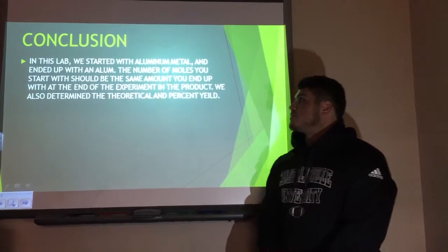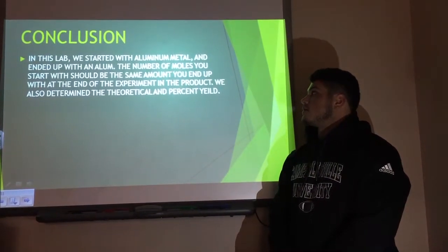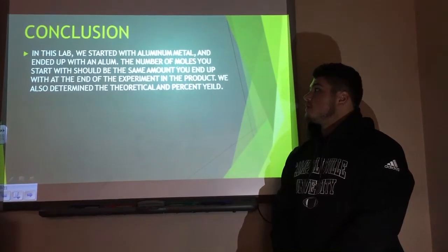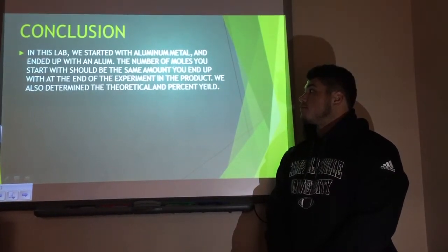In this lab, we started with aluminum metal and ended up with an alum product. The number of moles you start with should be the same amount you end up with at the end of the experiment in the product. We also determined the theoretical and percent yield.